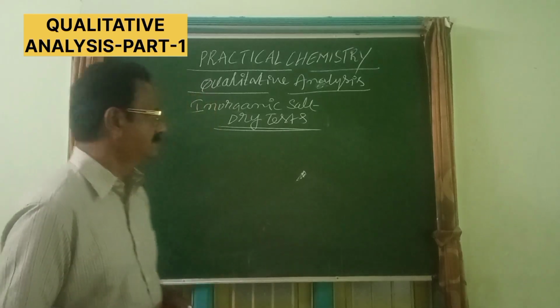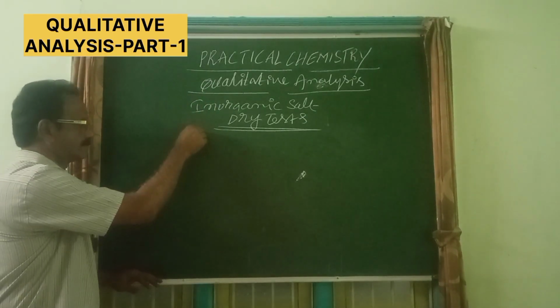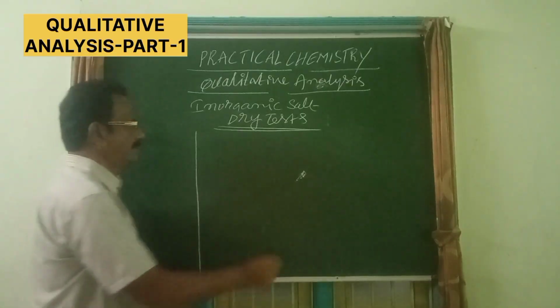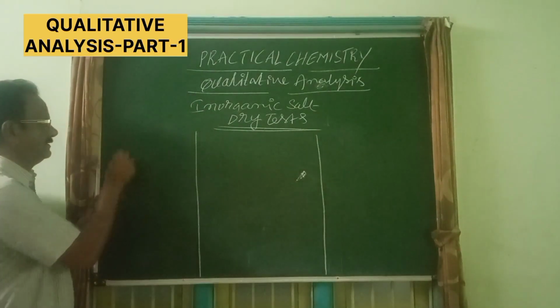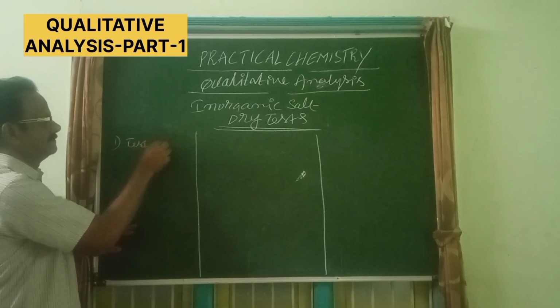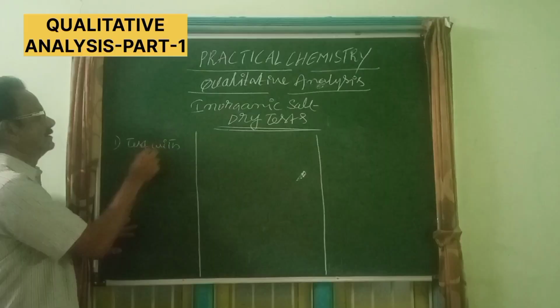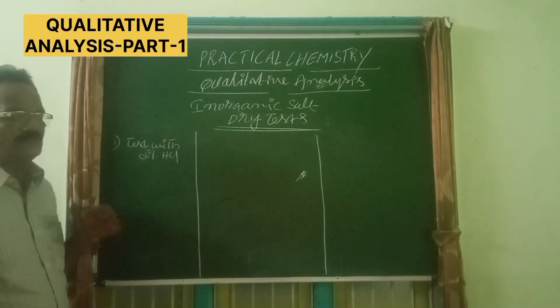Okay. Now, among the dry tests, the first test is the test with dilute HCl.